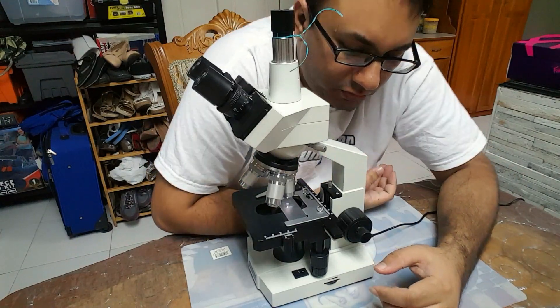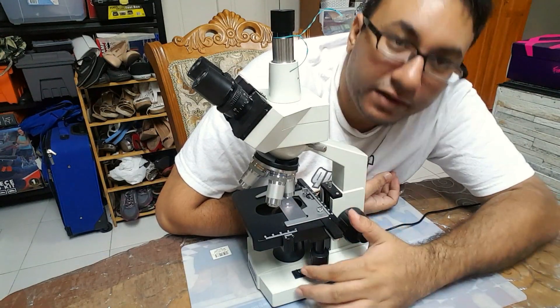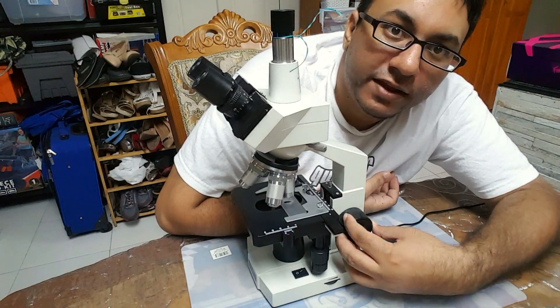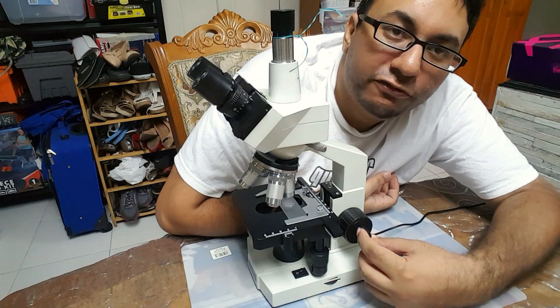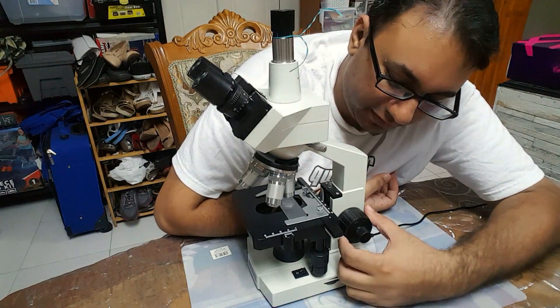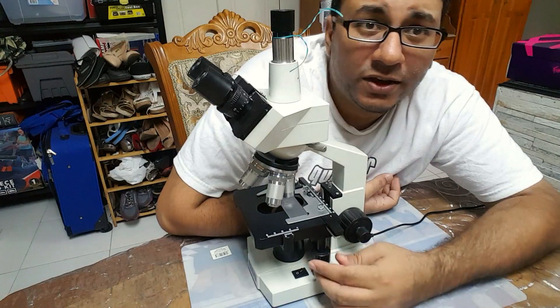Now let me talk about the nice parts of the microscope. You move up and down to find the sweet spot to see whatever is on the slide. It moves in two ways: full coarse movements using one knob — you can see how fast it moves — and then fine adjustments using the other knob on the side for slower, fine-tuning focus. It has two gears to do that. It also has controls on the side to move the slide left, right, up, and down.